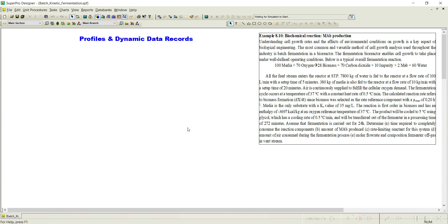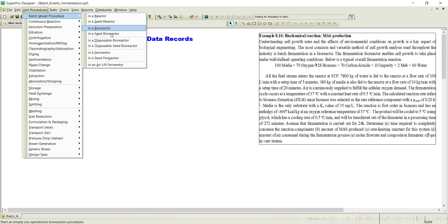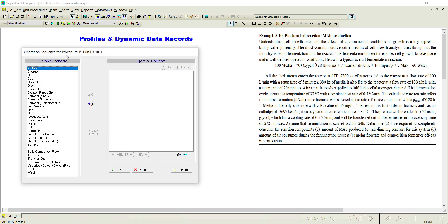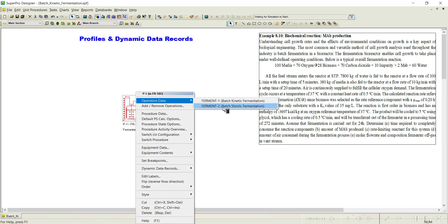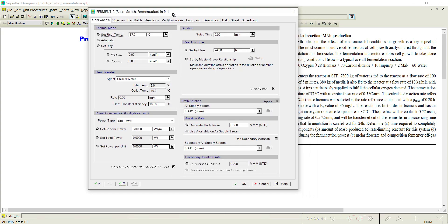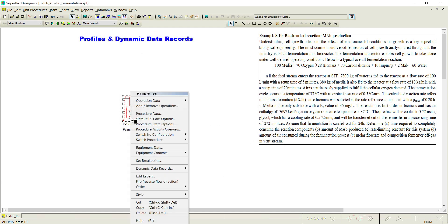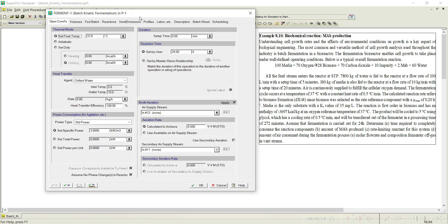Generally, we see these profiles whenever we use the ferment kinetic option. You do not see this option in ferment stoichiometry. I will show you where this particular option is available. I will select a fermenter, add an operation — we will add both the ferment kinetic and ferment stoichiometric operations. Click OK, and if you go to the ferment stoichiometric operation, you do not see a profile option here. But if you go to fermentation by kinetics, then you will notice there is something called a profile.